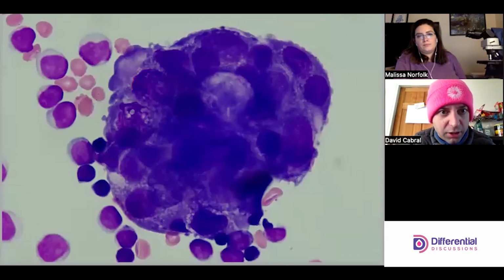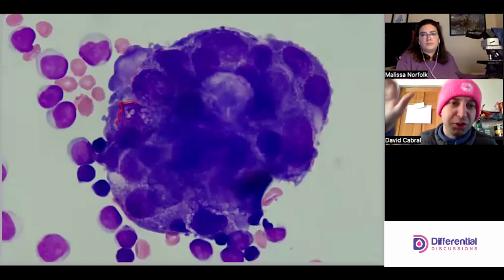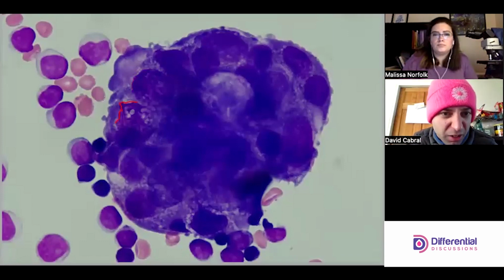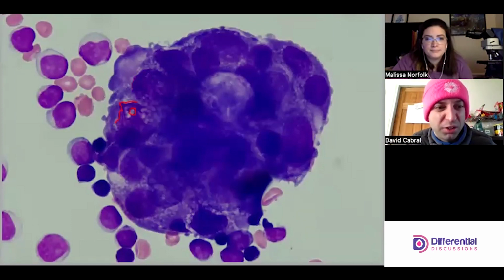Very strange. Usually mesothelial cells, which these would be in a normal circumstance, have smooth contours to their edge. Look at this, there is some kind of vacuole or a punch-through in the nucleus. So that's troubling.